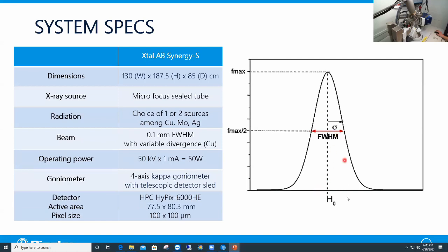Now, the amount of intensity that comes through the full width at half maximum, as shown by this box here, is about 50%. The other 50% comes from the addition of what's left outside of the full width at half maximum, in the tails of the beam, on the left here and on the right. Given the overall strength of the beam, 50% of it is already quite a lot. Therefore, it is fine to start screening crystals that match the full width at half maximum of about 100 microns. The reason for this is that smaller crystals will usually generate smaller, sharper reflections, which will improve the quality of the dataset.